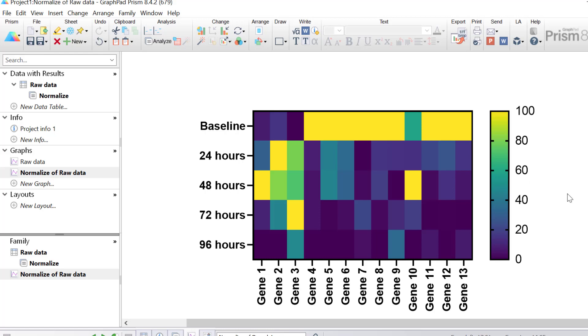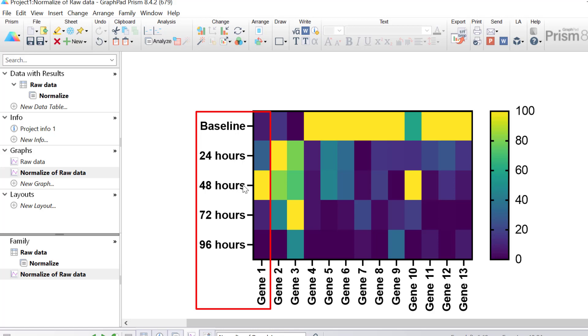This normalisation makes it so much easier to interpret the time series of each gene. So if you look at gene 1 for example, you can see that as the time goes from baseline to 48 hours, there is a large up regulation. Then from 48 hours to 96 hours, there is a down regulation.